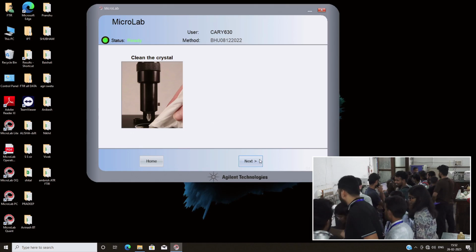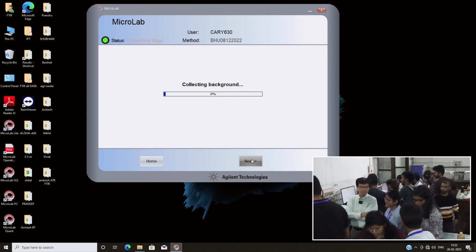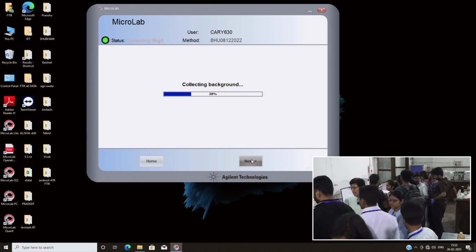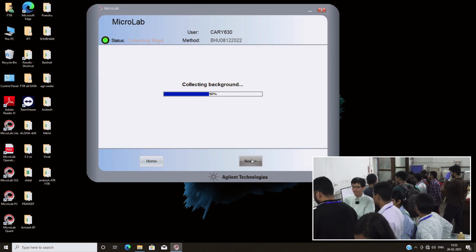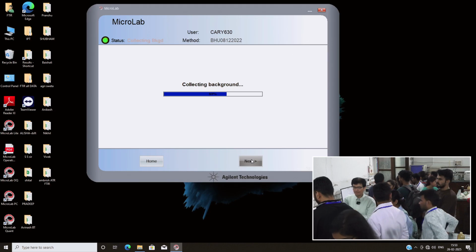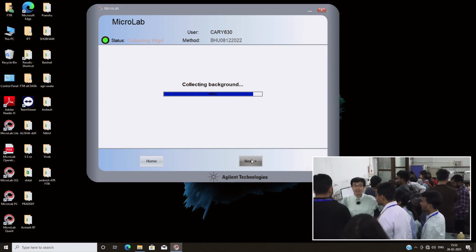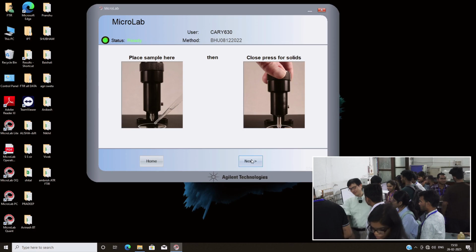The first measurement is I0, air. The biggest mistake during the experiment is to fail to save the data after a long time accumulation. Today's experiment finished. Go home.